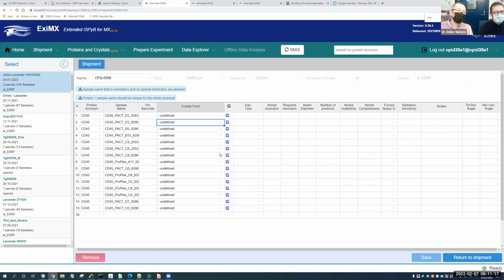Importantly as well, this will be used to force that space group during characterization. If the space group is defined there, you'll only get the strategy for that space group. So if it has a tendency to change, or if you get it wrong, characterization will fail with an incorrect space group. That isn't a disaster because we'll always collect a default data set, but I want to underline that you should be sure the space group is correct.